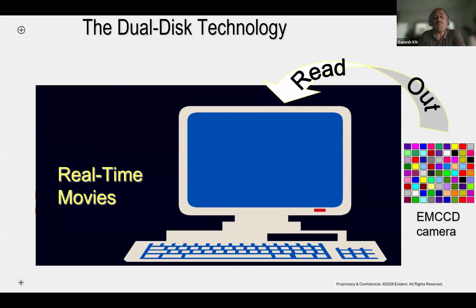By doing this, we have overcome the issues of the point scanning confocal microscope, which images only one point at a time. Now we have multiple points to excite, and we have improved the excitation efficiency by incorporating the dual disc technology with the microlens. The excitation efficiency has increased.